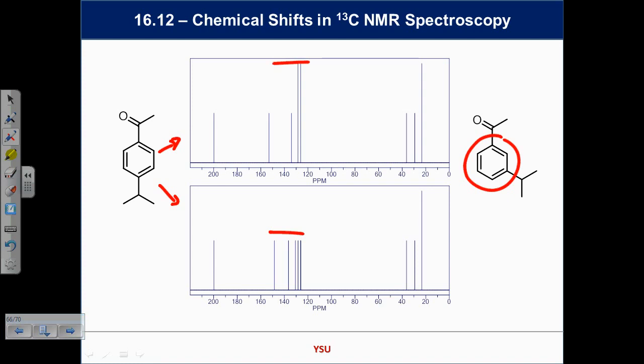And keep in mind where we are about to go with the benzene chemistry. We're about to make benzene derivatives and then analyze them and work out what happened in terms of their substitution patterns. So now I can see, well, I've got a proton here, that's 1 of them, a proton there, that's 2 of them. Why do I have 2 signals taller than the other 2? These are all for the benzene. Why are 2 larger? 2 sets of them are the same. This carbon is the same as this one, and this one is the same as this one. So you expect 2 signals that are larger, and then the top one and the bottom one are different, and only 1 of each of them, so therefore smaller. It's that simple.